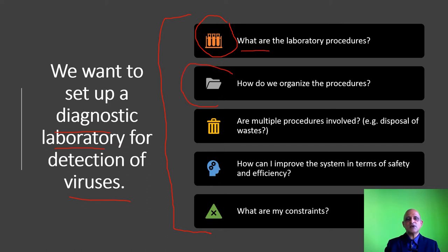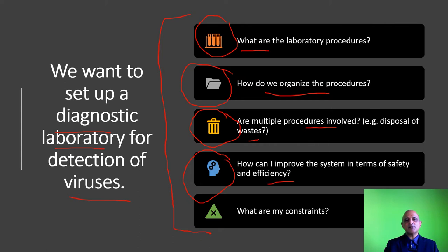Then we move on to the organization of procedures and the workflow. How will the sample be received? How will it be processed? How will the data be recorded? These are the organizational aspects. Then there is the waste management aspect — is there any waste generated? How can I improve the system? For instance, if you implemented a workflow and found there are limitations, how do you improve efficiency? And finally, what are your constraints — do you have sufficient PPEs and resources to dispose of waste?